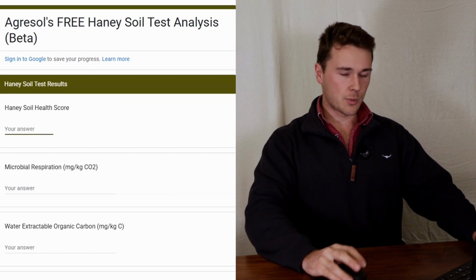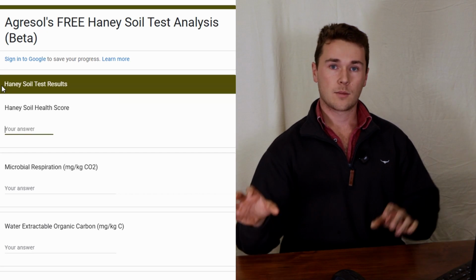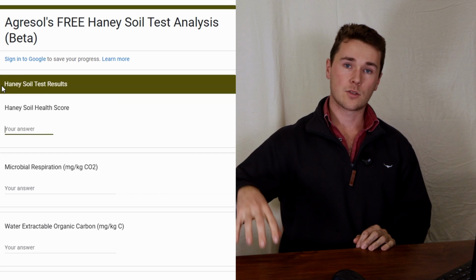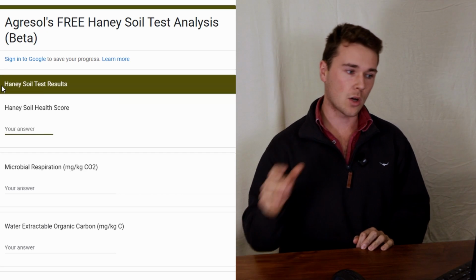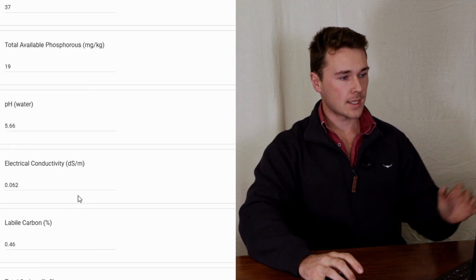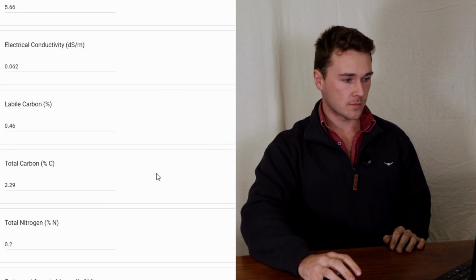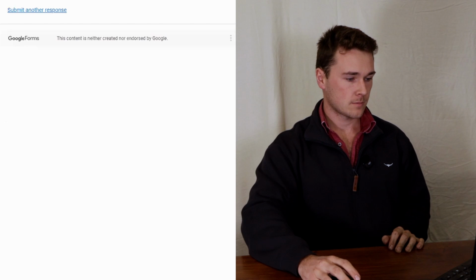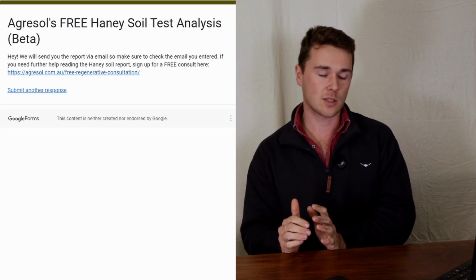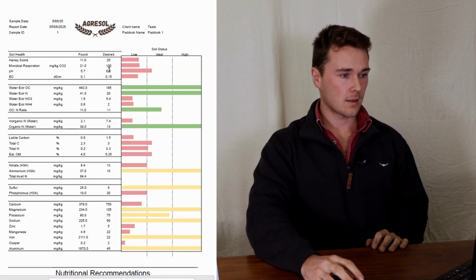So what you want to do is put all your information into the form here. The form will send it to a Google Sheet, process all the data, put it through our custom-made calculator or spreadsheet, and spit out the interpretation for you at the end with everything you need to know. So I'll quickly put all the data in and then send it off and I'll show you. Once that's all done and you've put all your numbers in, as you can see here, you can go right down to the bottom and press submit. Now it'll go through the sequence, process your information, put it into a custom-made sheet, and then email it straight into your inbox. And then once you get it, it'll look something like this.